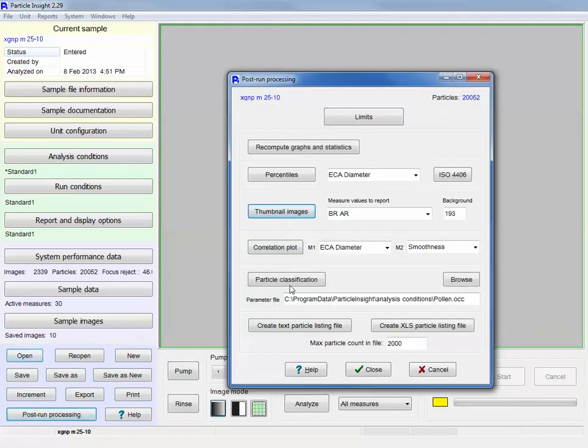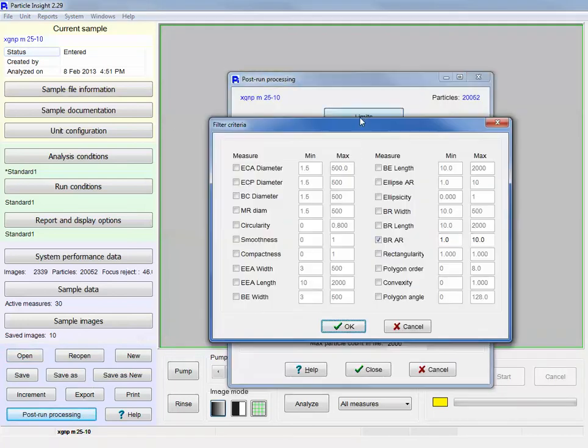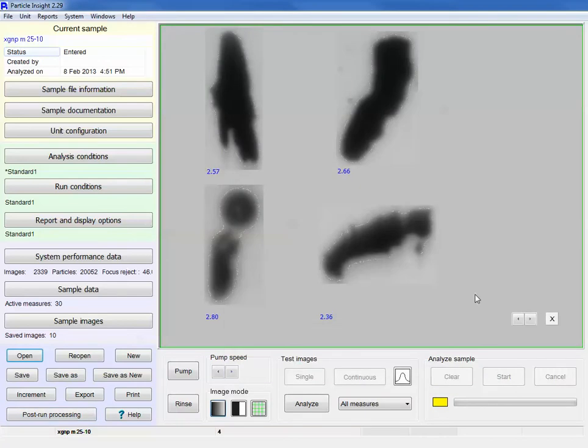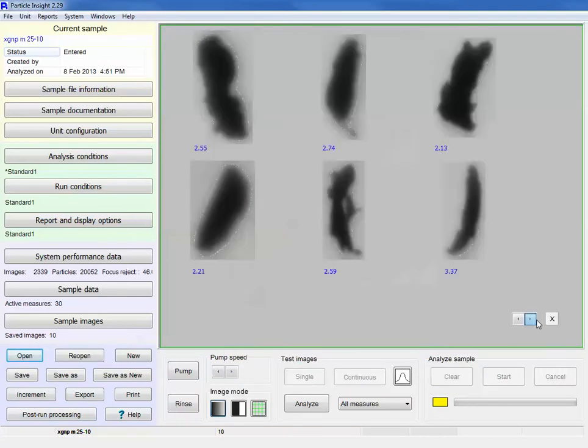Let's say we increase our aspect ratio limit to, let's see, let's make it 2.2 and greater. Let's just say 2.0 and greater. So we'll look at all particles with aspect ratios 2 and greater. At the end of the day, what we're trying to do is define the line of what we think are particles on their side or not.